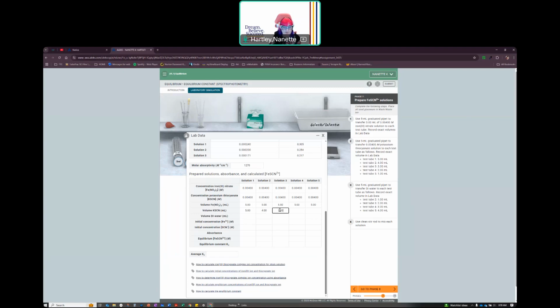And this is where, if I was in the physical laboratory, I could make mistakes. And I might not necessarily be able to notice that. So if I didn't have good skill in using the pipette, I might not notice that I didn't get the exact right volume. And therefore, I might not notice that I have a potential source of error. All of those errors are extremely cumulative. And so if my calibration curve isn't very good because I had errors in the calibration curve, then I'm going to have errors from everything that I determine off of that calibration curve.